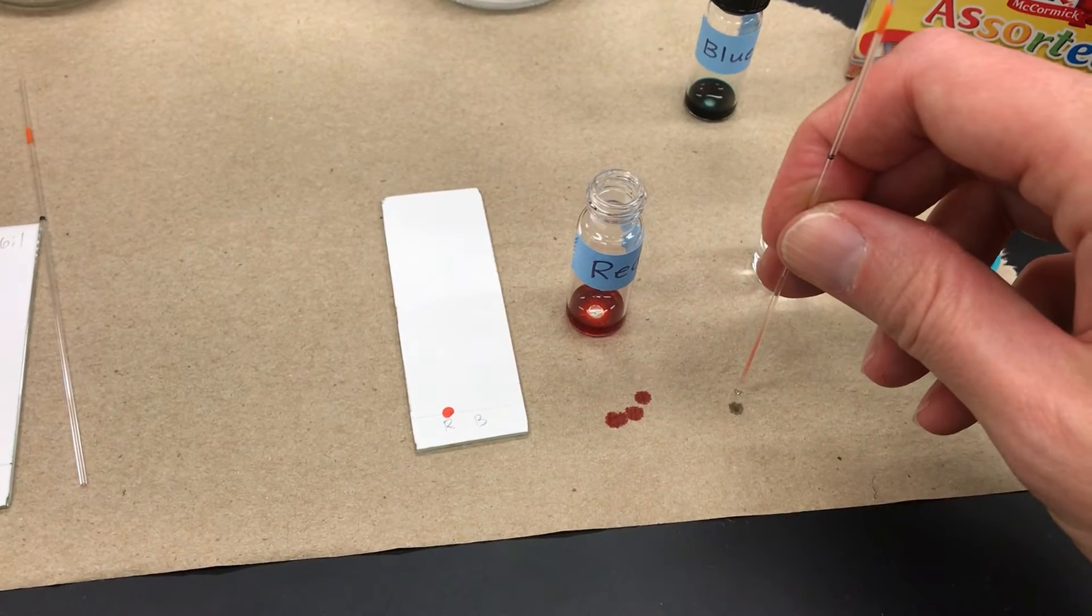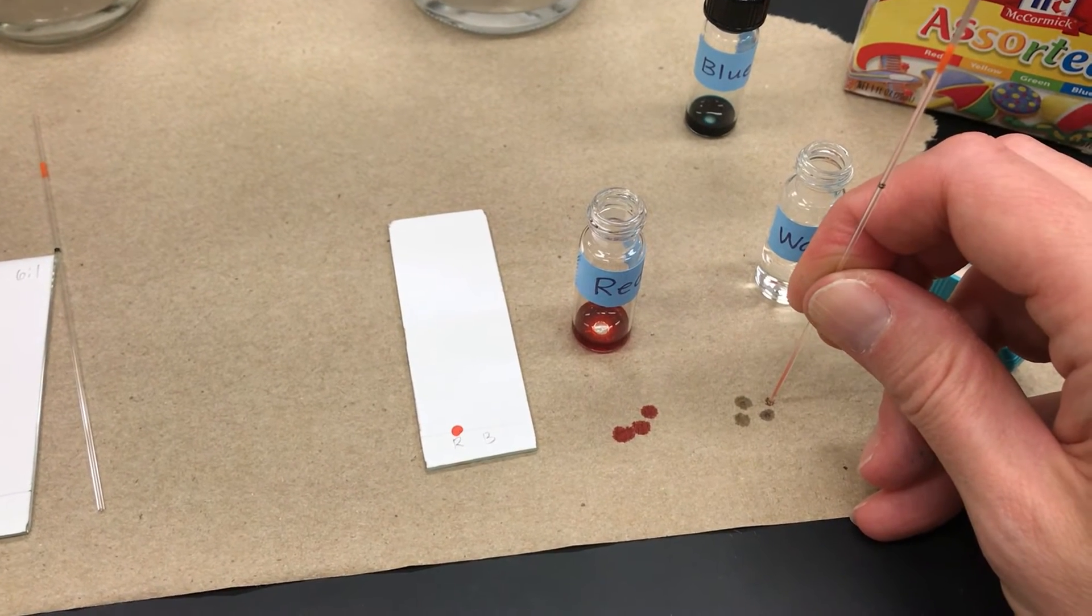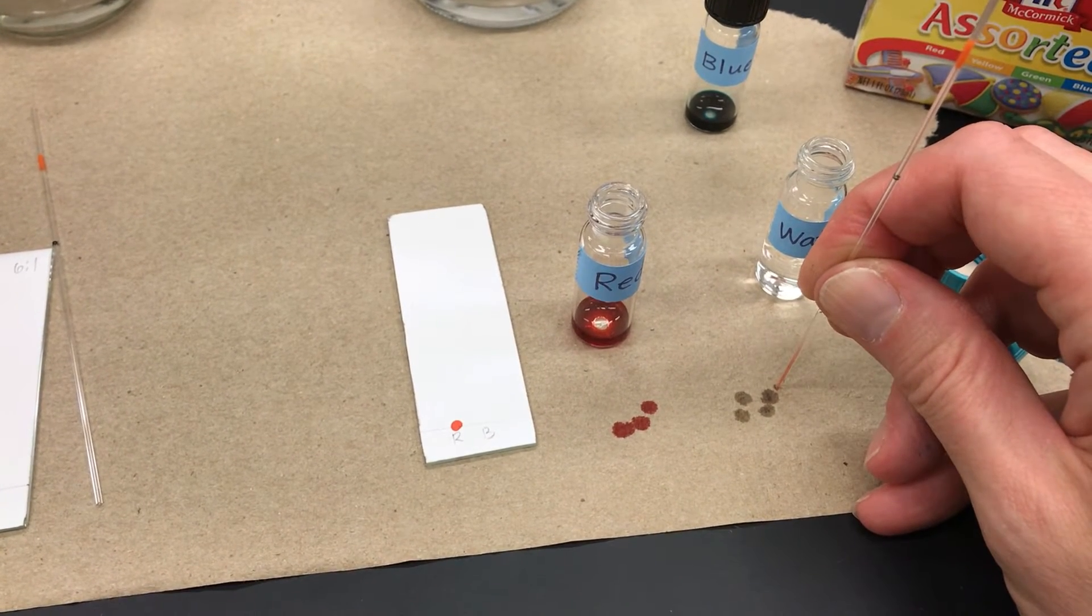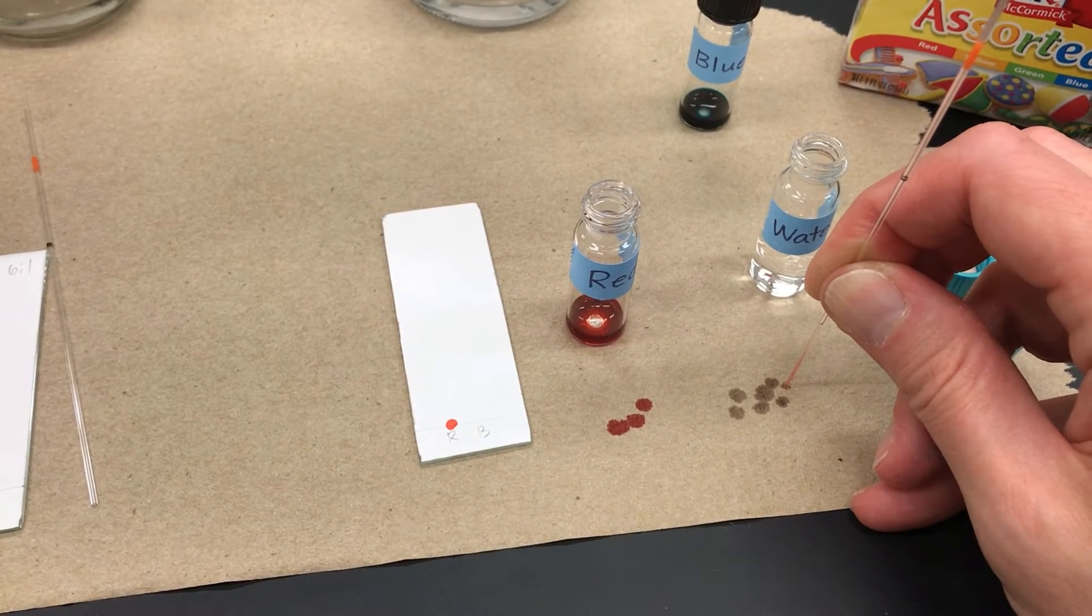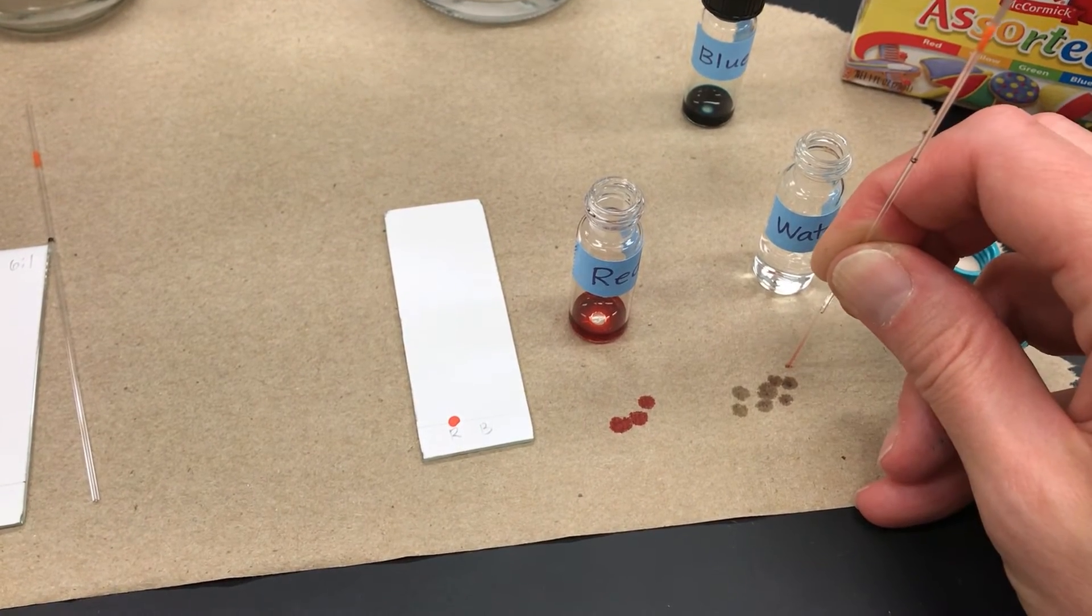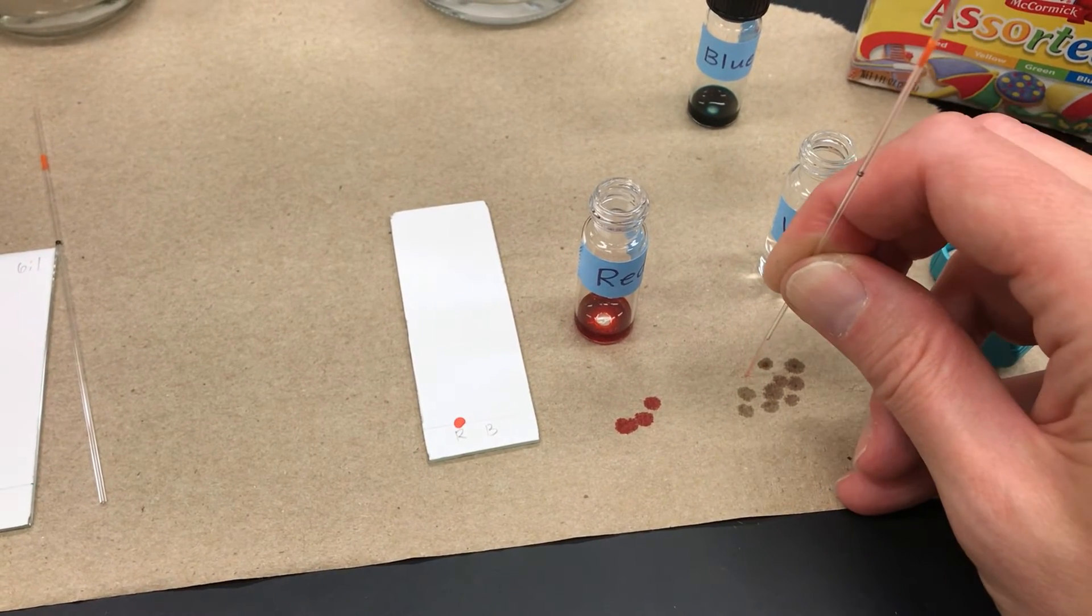I'm going to use the same capillary tube again. I can't just go and stick it in another sample, it's going to contaminate. So I need to rinse it out. For food dyes, since they're water soluble, I use a little vial of water. And I'm rinsing it out with the water.